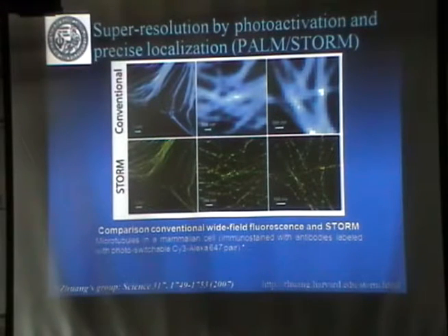So each image is a time slice. You're doing a pulse experiment. Right, so this image was obtained after, say, 1,000 images, and each image had a few points. And are you assuming during the time of the pulse that you have only one molecule that turns on, as opposed to several? You need a few molecules, not one. A few molecules, but a given molecule will not blink on and off during the time frame of the pulse, is that correct? Well, you have time periods and they do blink, but you are assuming that in each position you have only one molecule.